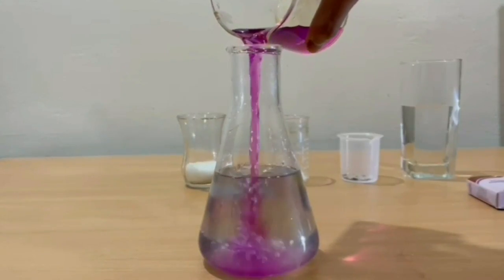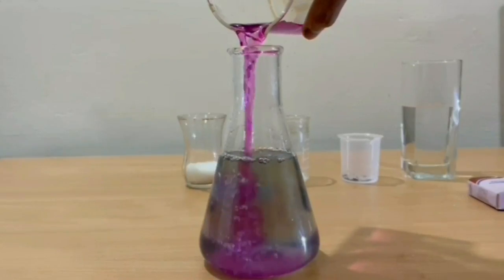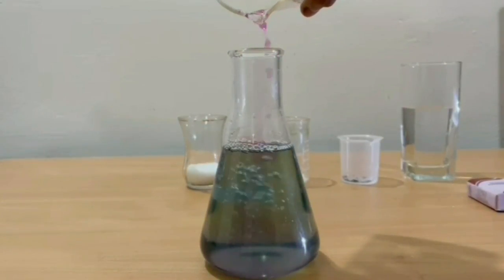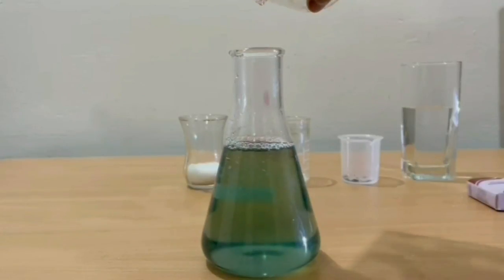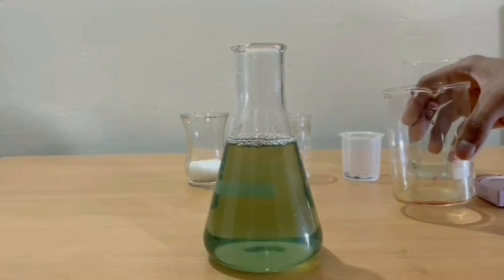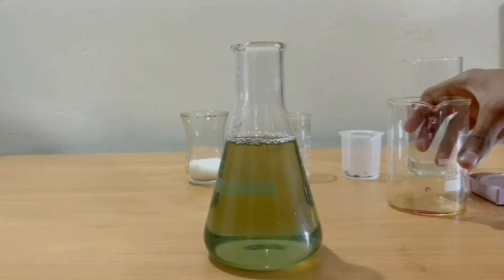During the reaction, potassium permanganate is reduced to potassium manganate, which is green in color, and then to manganese dioxide, which is yellow in color. This redox experiment is very attractive to see.